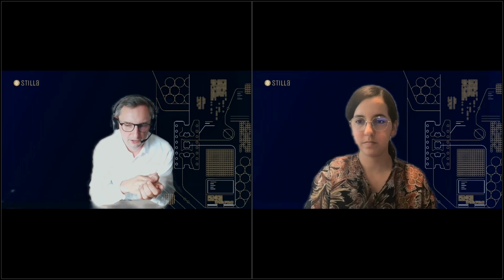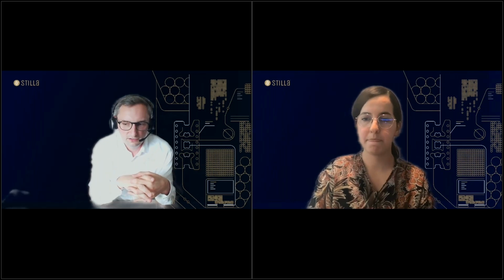Yeah, but in the qPCR, you can just load more DNA and compensate by that. But then you also have to make sure that the huge amount of DNA does not inhibit your PCR reaction. So it's complicated.